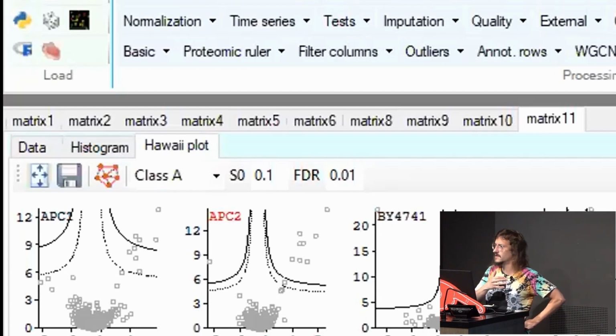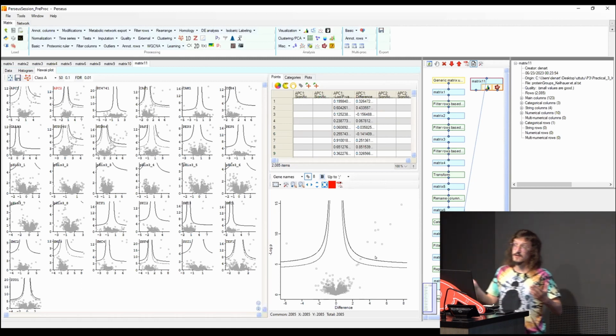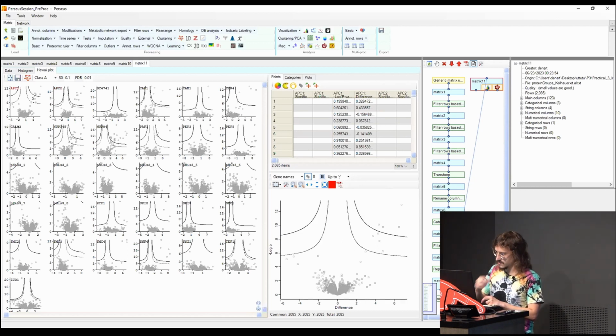The other one is a less stringent, usual 0.05, no, 0.05, 0.5. And it is just a thing that you can use to see how sure you are about that. The lower the p-value is, the better it will be. So in this specific condition, let's take this APC1.